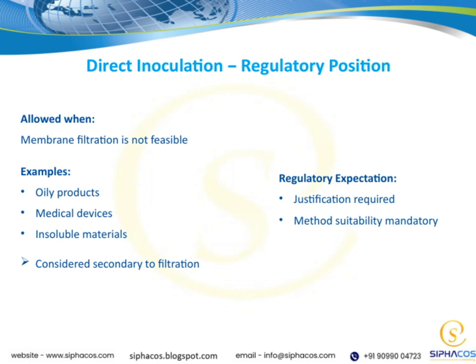When it comes to direct inoculation, the regulatory position is quite clear. It's allowed only when membrane filtration isn't feasible. For example, this might be the case with oily products, where filtration can be challenging, or with medical devices, which often have complex materials. Insoluble materials also fall into this category because filtration might not be effective or practical.